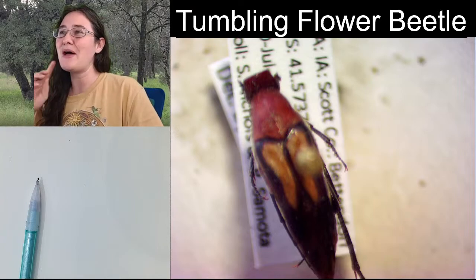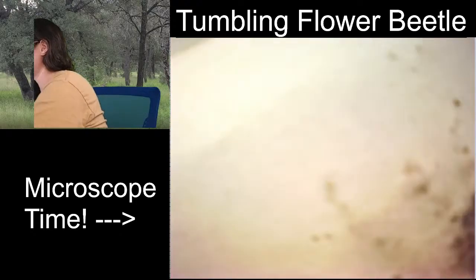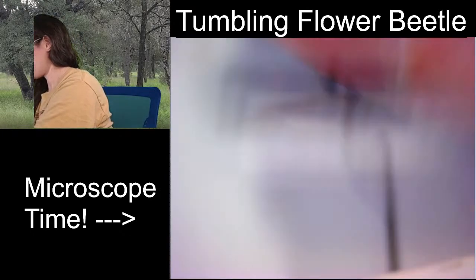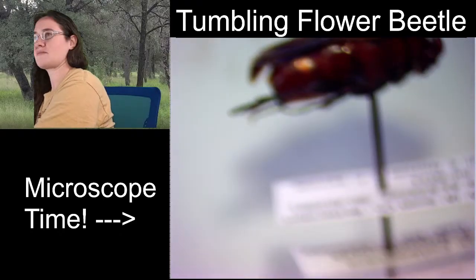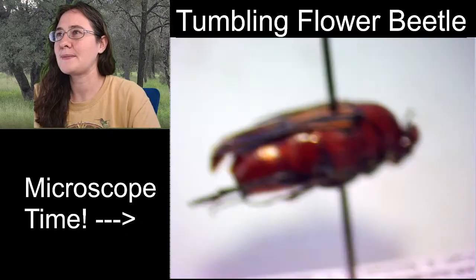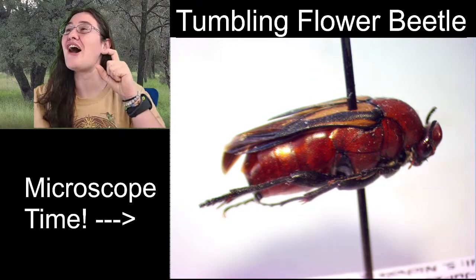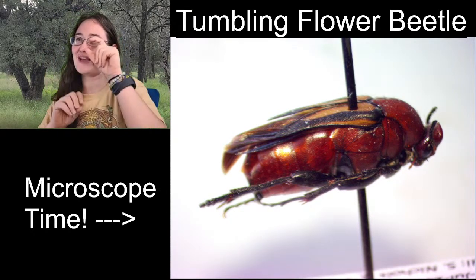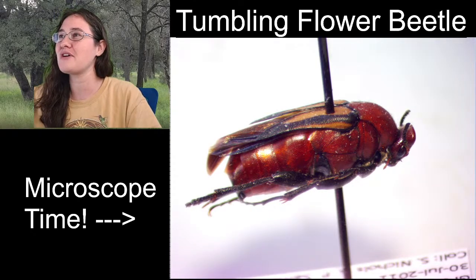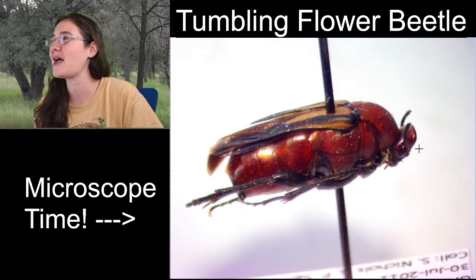Good. But if we turn this beetle sideways, you see, he's really, really tall. So he's really narrow, but he has a pretty good height. If I get it all the way zoomed out, right about here, this is about where I can get a measurement, and I can measure from the front of his head to the back of his abdomen pretty easily.